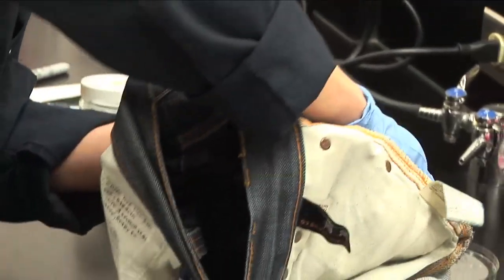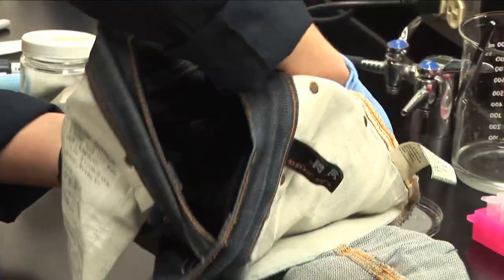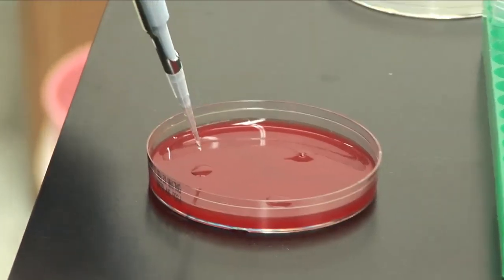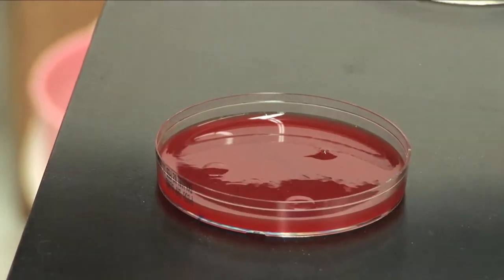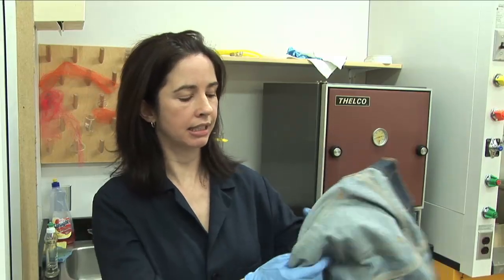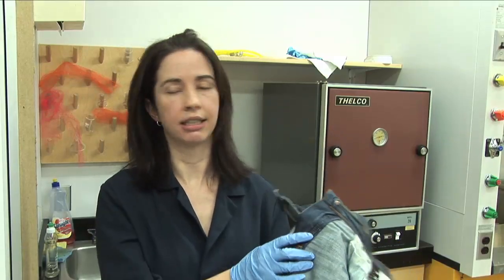We're looking at what types of bacteria may be on these jeans and how many of them — I'm expecting quite a high concentration. We want to get an idea of the counts of bacteria in certain locations, so we took samples from the back of the jeans and the front, just near the fly.